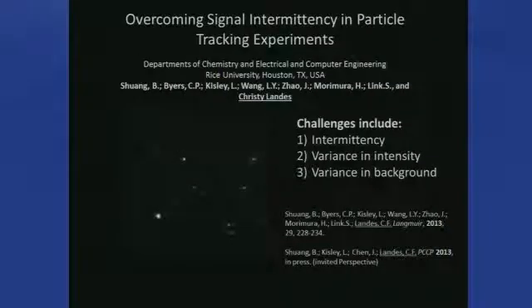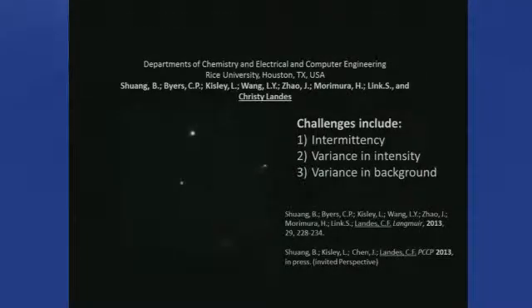So for example, underneath some of the things that I'm going to tell you about today is the need to do particle tracking, but in noisy, messy and heterogeneous systems where you have intermittency or variances in intensities, and to understand transport in charged and crowded environments, such as you might have at the interface between a stationary phase and a mobile phase. So we spent some time worrying about that.